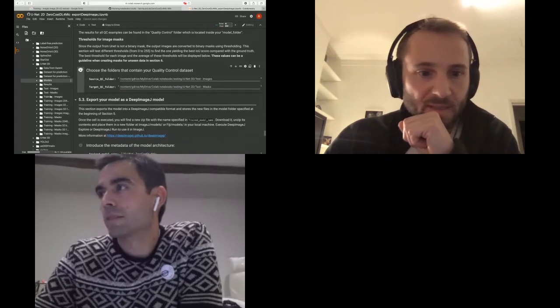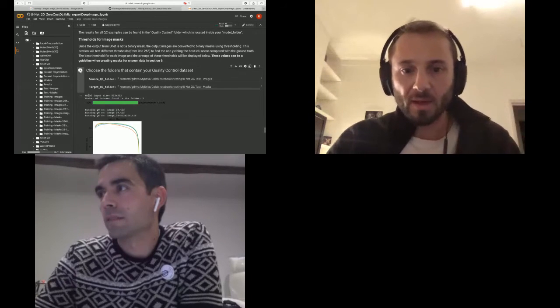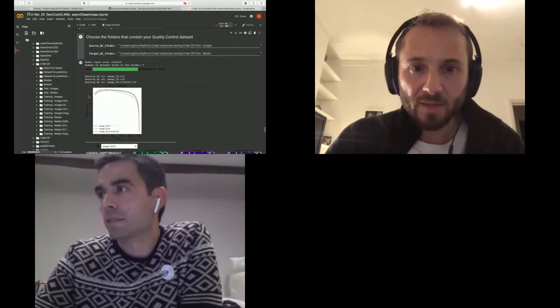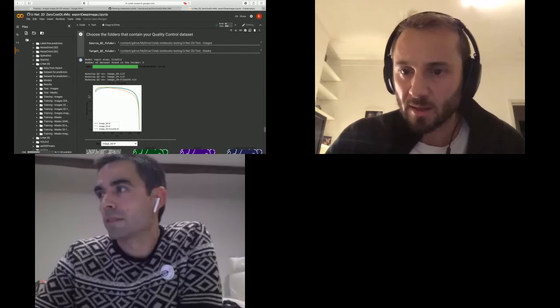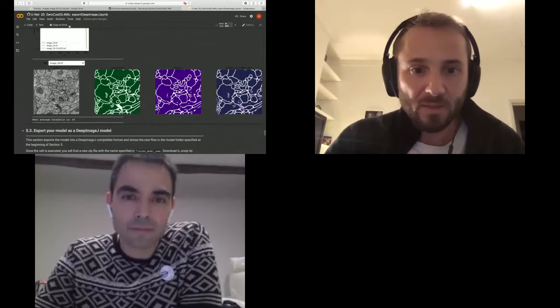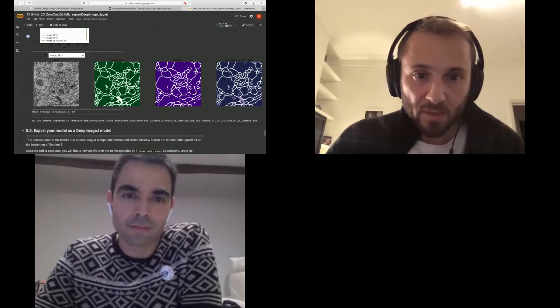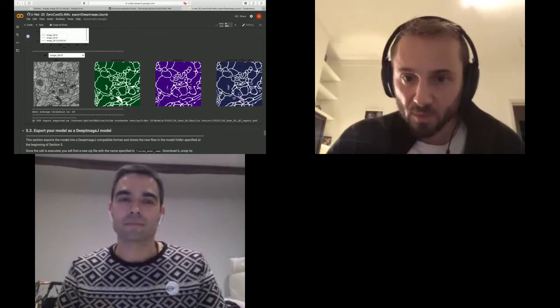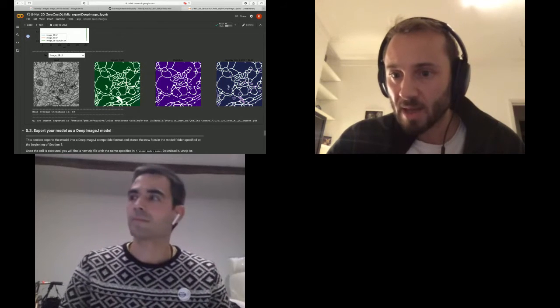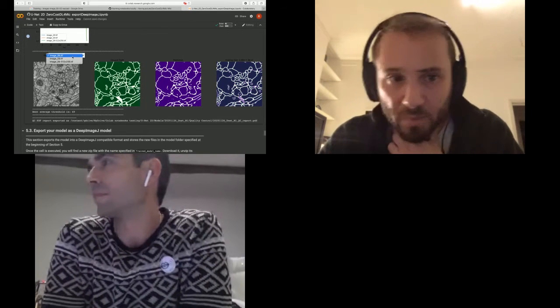If I run this, I've got a couple of examples that were not included in the training data, but are similar, the kind of data that I would be interested in using for my predictions. And for this, I also provide a mask. In this case, we now have the input data right here, the ground truth, the prediction data. That's what we got out of the network, and therefore the overlay between the two right here. And so you see where it got it wrong, right? Where it's purple right here, it got it wrong. It missed out a few bits.